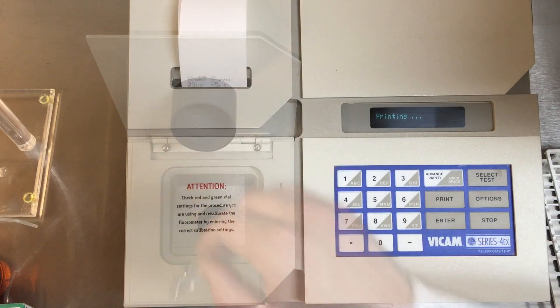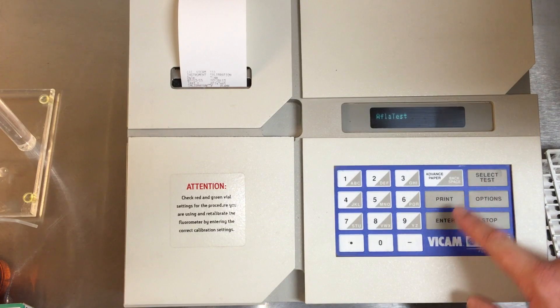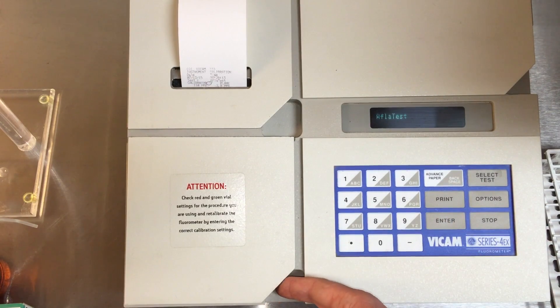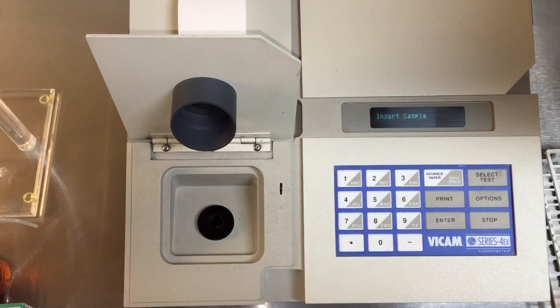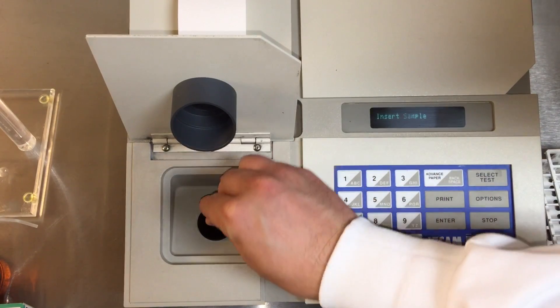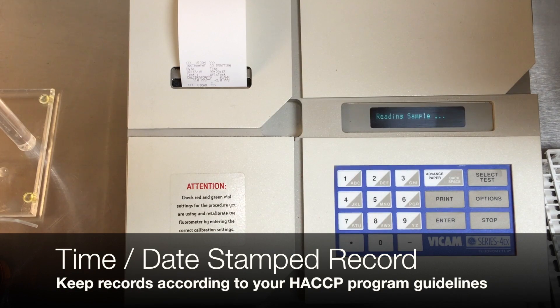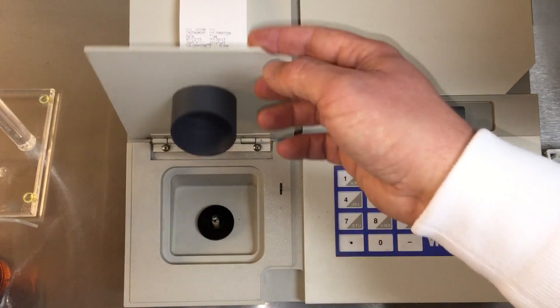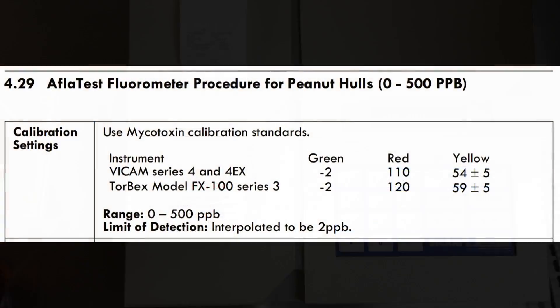Remove the green vial. We will now test the calibration. Press Select Test and press Enter to select AFLATEST. When prompted to insert the sample, insert the yellow vial. This will start a 60-second countdown to read the sample. After 60 seconds, you will receive a time-date stamped record of calibration. Validate that the result from the yellow vial is within the range stated in the current calibration settings.